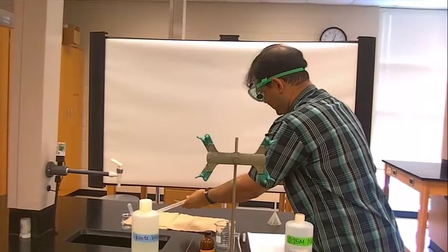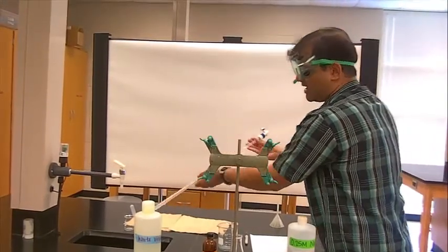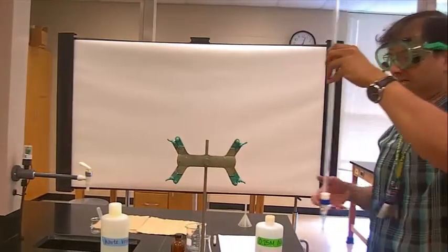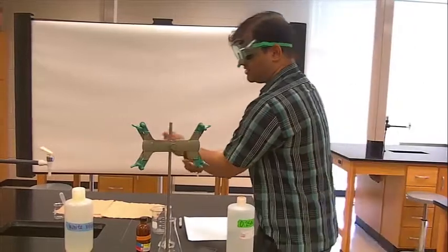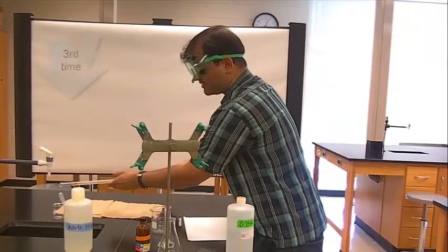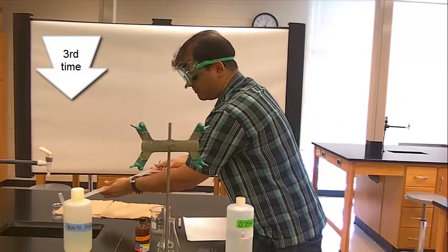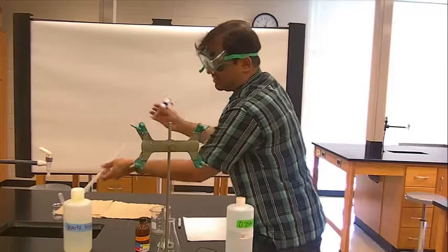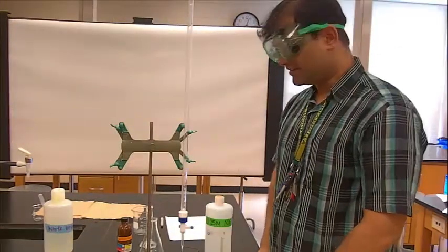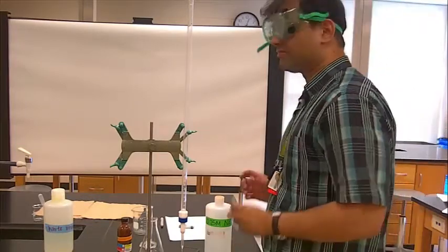And just coat the surface here. We're going to do that 3 times, so that was my first one. I'll do this 2 more times. And once again, just coating the sides of the titrant. In this case, that's going to be 0.25 molar of NaOH. All right. But now that we've cleaned this, let's go ahead and fill the burette up.